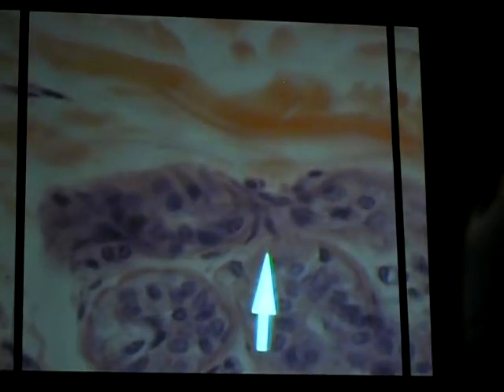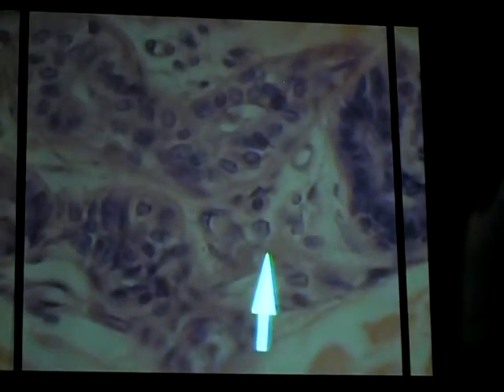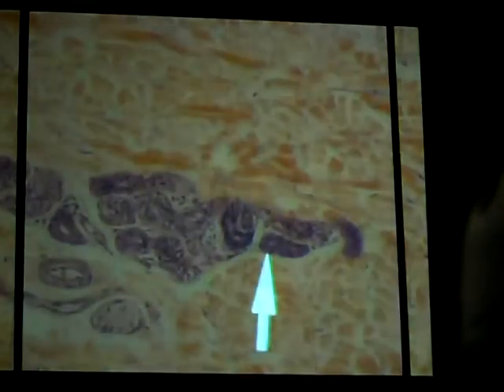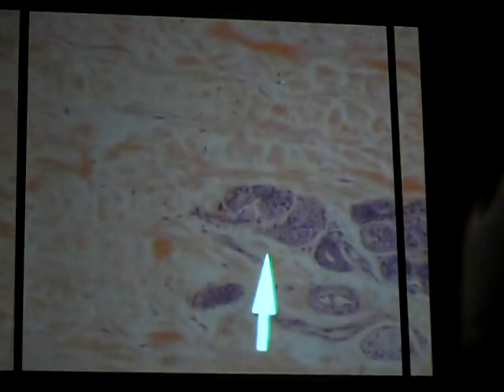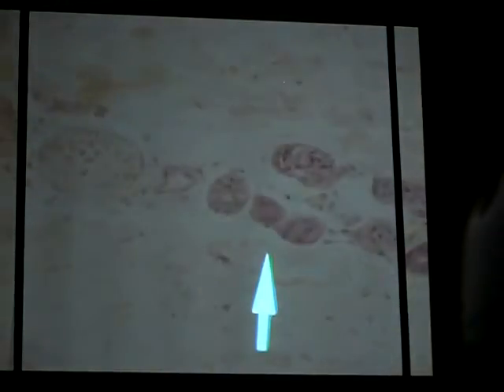The mammary glands are an example of your apocrine sweat glands. Those are kind of modified sweat glands, so I'm going to show you those in a minute. Alright, so most of these that we're seeing here are your eccrine sweat glands. So we have some here, here's some more over here.